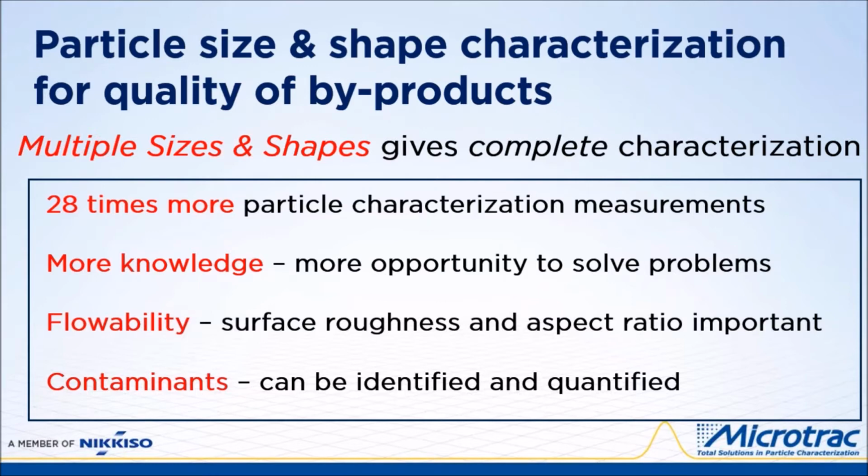Another general concern in particle processing is the presence of contaminants. Contaminants can be identified, isolated, and quantified by image analysis.